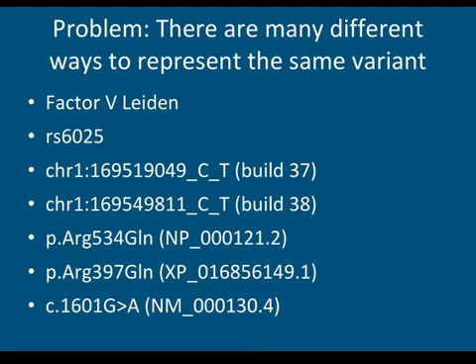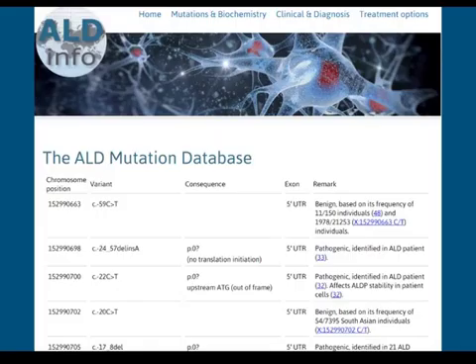However, once this is done, the next step, it would be really nice if this knowledge could be saved somehow, so the next time someone's looking for the same variant, they don't have to repeat the literature search, even within the selected literature we've pulled up. So that could help even more. So sometimes now, if the genetic counselor or researcher is lucky, there might be a database like this database for the ABCD1 gene association with adrenoleukodystrophy.